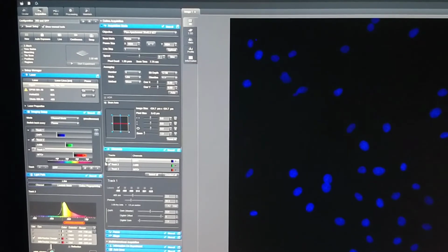Okay, so which means you might need to come back and check the fluorescent intensity in the image, whether it's saturated or if it's undersaturated, you want to increase or decrease it. So I generally recommend you start with the channel that has a protein of interest and find the focus from that, and then you don't want to change the focus anymore, you just want to change the settings here.